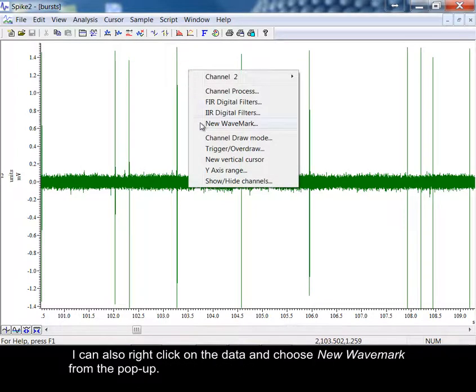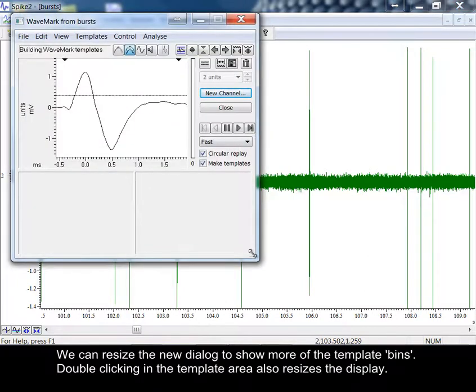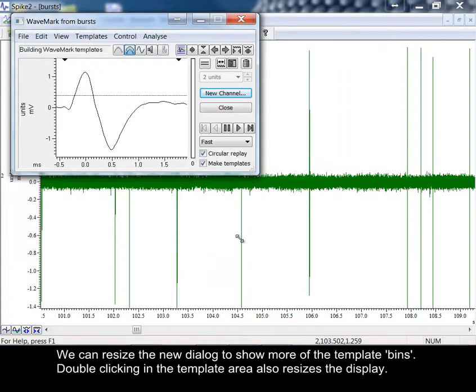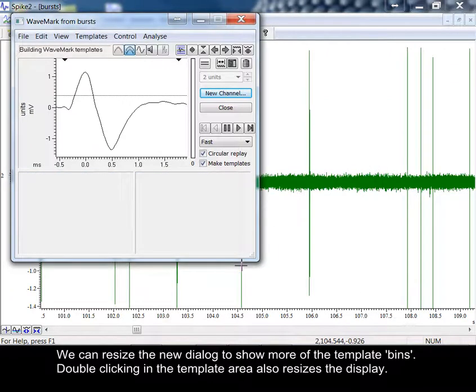I can also right-click on the data and choose New Wave Mark from the pop-up. We can now resize the new dialog to show more of the template bins. Double-clicking in the template area also resizes the display.